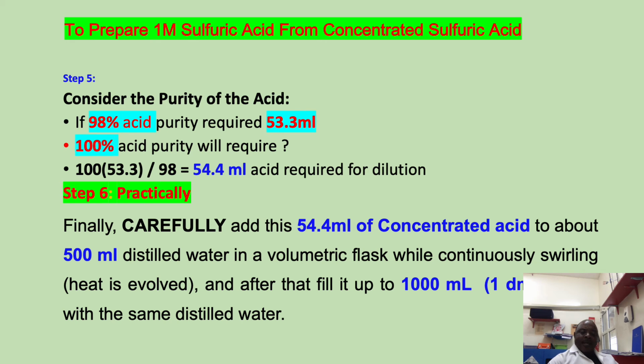water is less dense and it will flow on the acid, and that will establish a layer. And then between this layer, there could be a reaction that can result in explosion and cause the acid to splash on your body, which is hazardous.